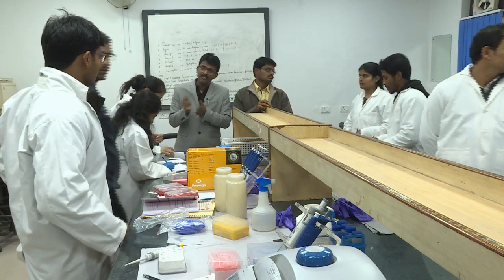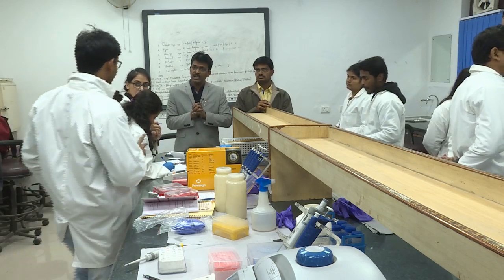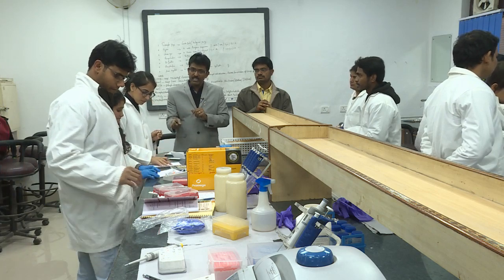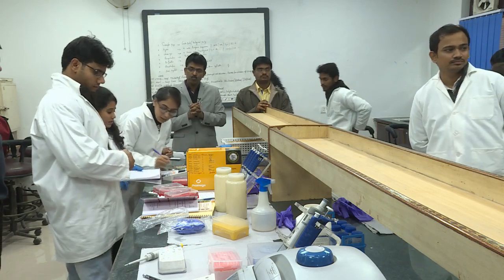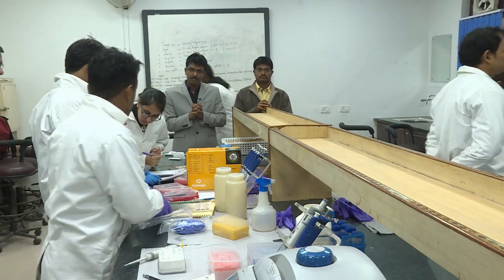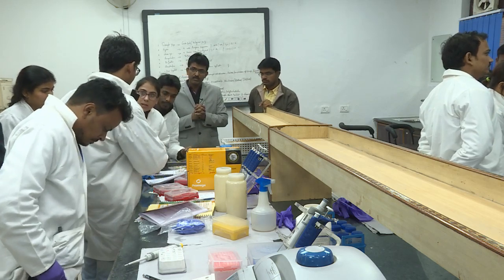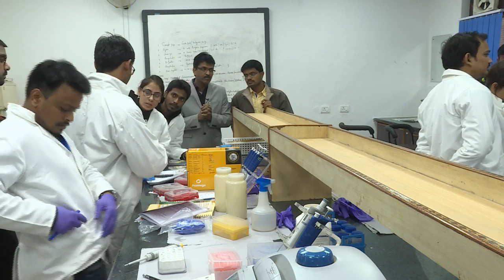Yeah. What about PCR for Magnaporthe? The protocol is done. Okay, protocol is there. Let them start that immediately now without loss of time. What madam told, मैडम ने जो बताया, have you written the calculation or not?